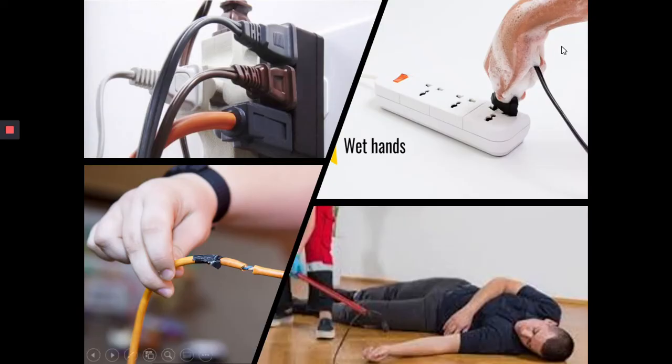So these photos illustrate the different situations inside the laboratory wherein there is a source of electrical hazard. Like for this one, this is overloading of the electrical socket. This one, plugging the equipment using wet hands. And then this one, if you take a look at the wire, the wirings are already exposed, and worse, this one, the person already got electrocuted.